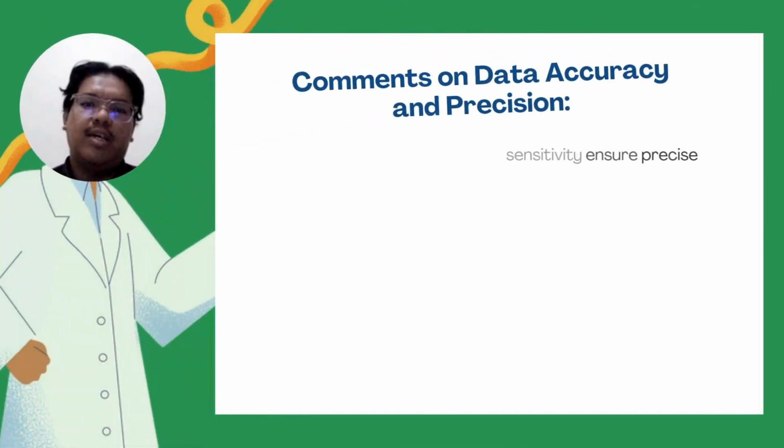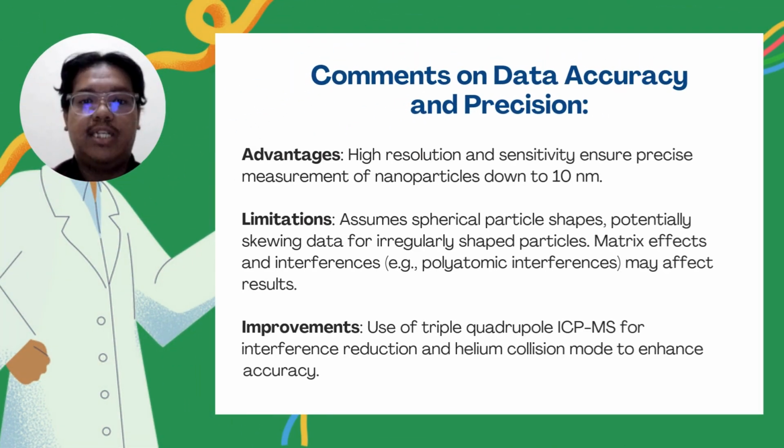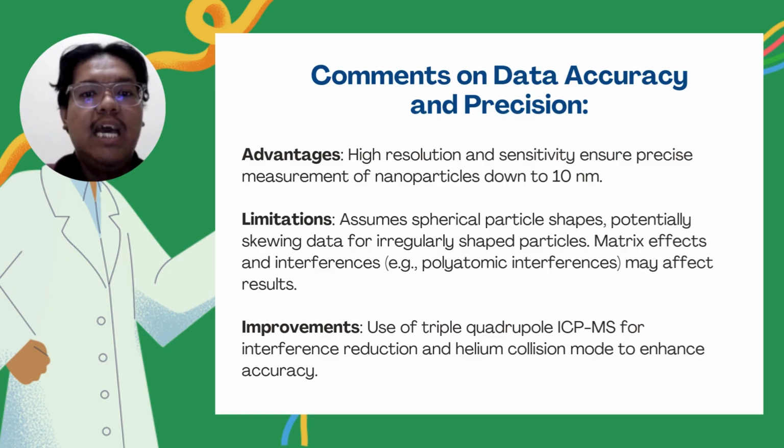Is the data accurate or not? So, comment on the data accuracy and precision. We can say the advantage is that ICP-MS itself has high resolution and sensitivity, ensuring precise measurement of nanoparticles down to 10 nanometers.